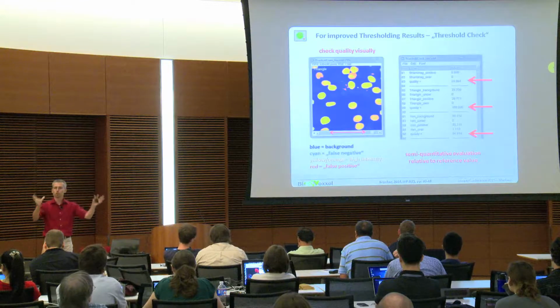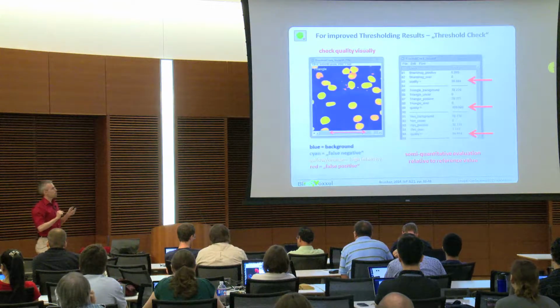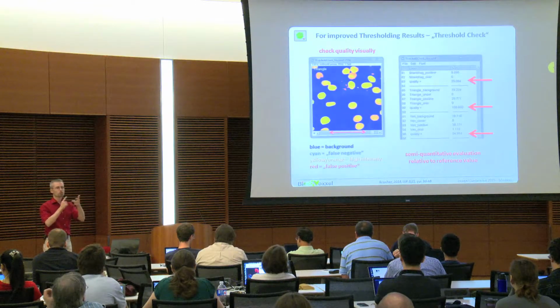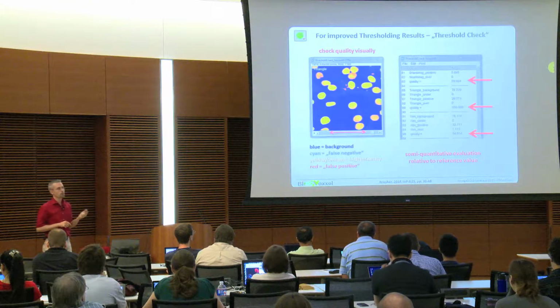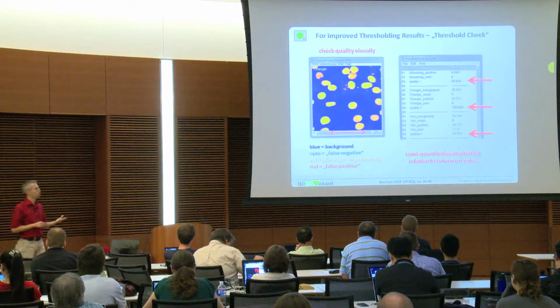So if you have bright features, there are some dark areas which you are still interested in, then you can put a reference point there. And according to that, the program does a quality measurement comparing true positive versus false positive and false negative and gives you a quality output, and thereby suggesting you a threshold which is best. But that obviously massively depends on where you set the reference point.